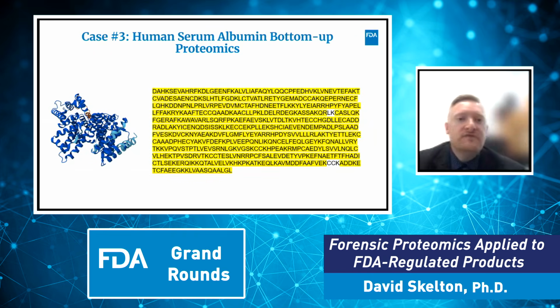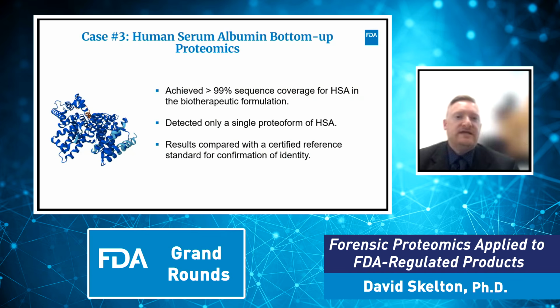We do this for all of the observed peptides, and in this case, we are able to obtain over 99% sequence coverage of HSA in the biotherapeutic formulation. And additionally, we only observed a single proteoform of HSA. We did not observe any modified forms. And these results were confirmed through analysis of a certified reference standard.